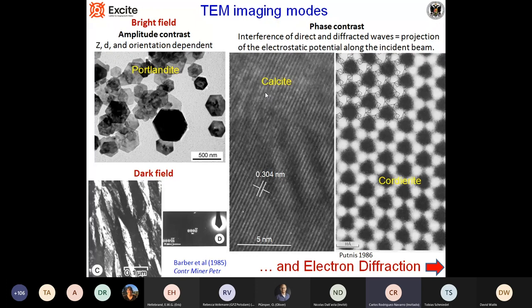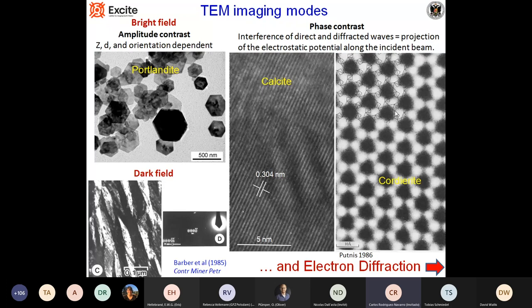In bright field, we can also have phase contrast. In the case of phase contrast, this contrast is due to the interference between the direct and the diffracted beams. What we have is a projection of the electrostatic potential of a particular crystalline material along the direction of the incident beam. A typical image by phase contrast is a lattice fringe, in this case of calcite — you can see the distance between the different planes, the rhombohedral cleavage plane, the 104. Or we can see a more detailed high-resolution image of another structure, in this case a silica cordierite, where you see the disposition of the silica tetrahedra forming characteristic rings.